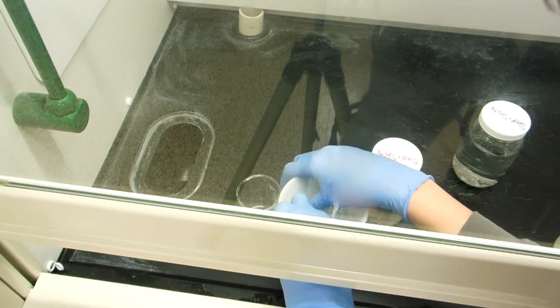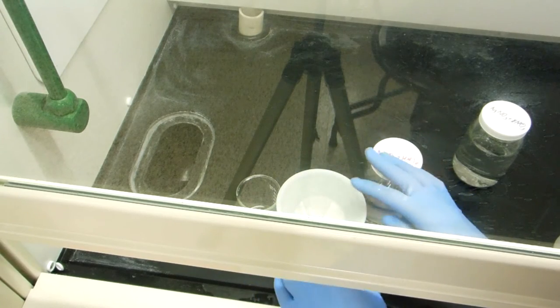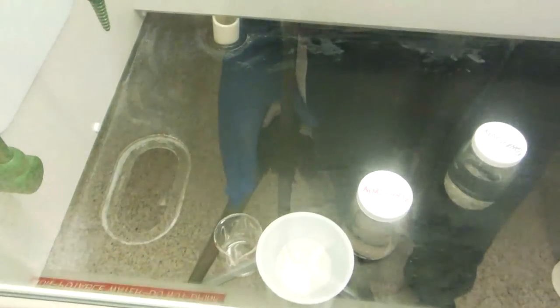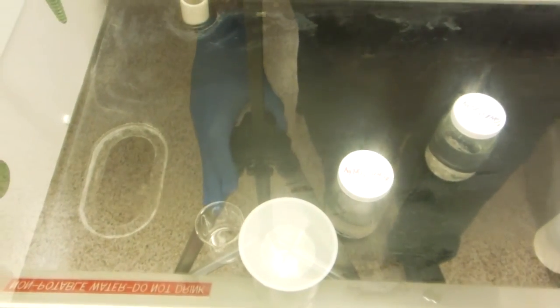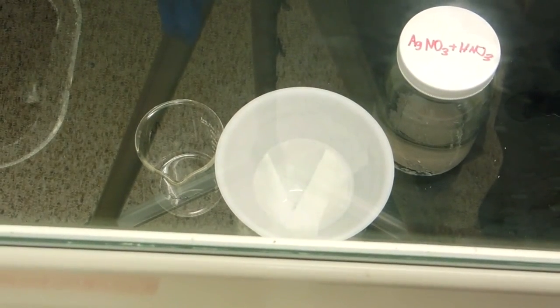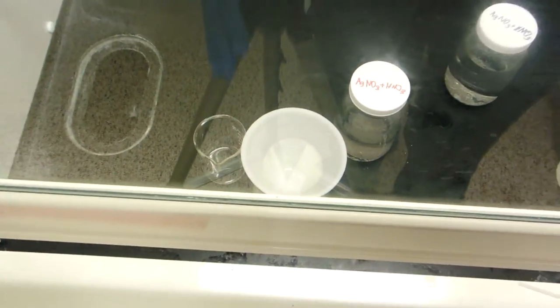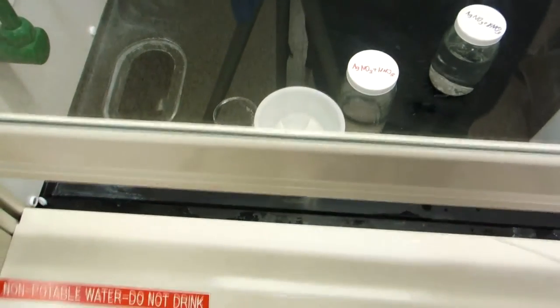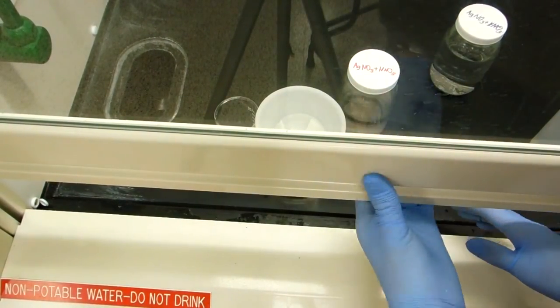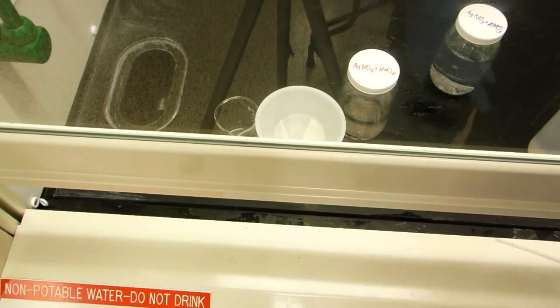So yeah, it sticks to the sides pretty well. It's kind of bright, but it's a bit too bright. But let that focus. And as you can see, it's stuck right on, which is a great sign. So I'll lower the sash a little bit.